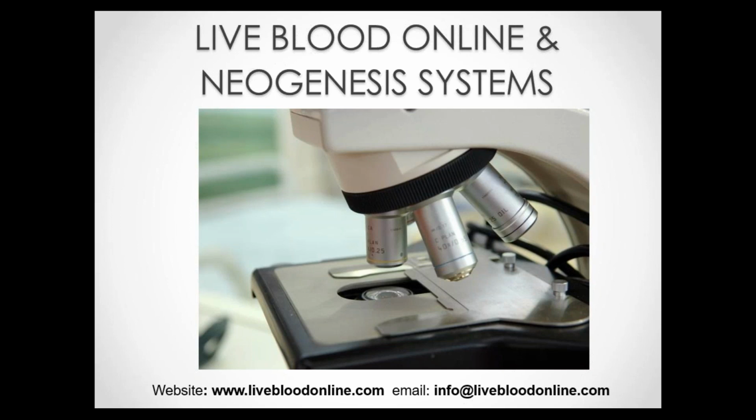Now, in practice, however, we simply don't see this type of variation. Of course, if a vegan, for example, decided to have a large steak a few hours before a live blood test, we can then expect to see the impact of this in the blood. But for patients following their normal daily routines, the results are always very accurate.